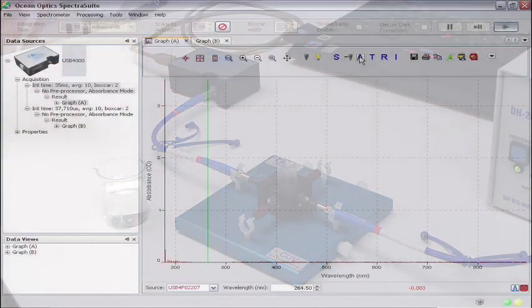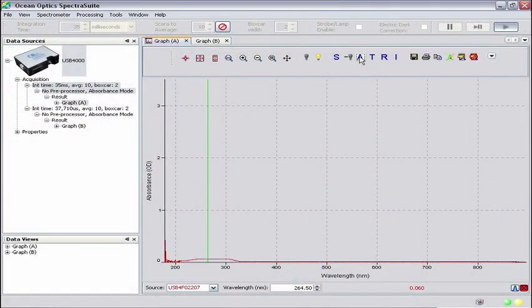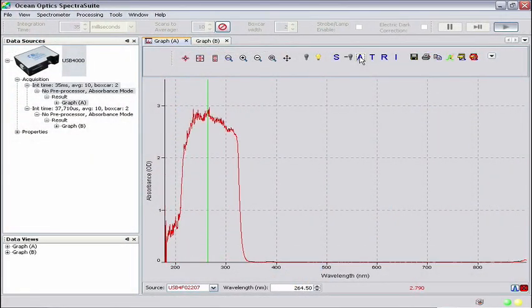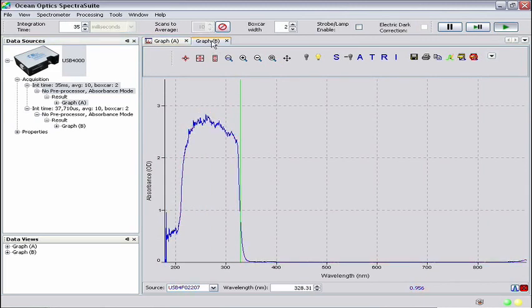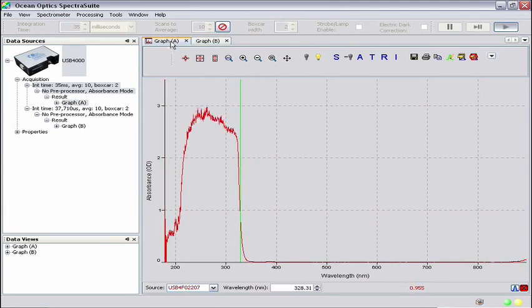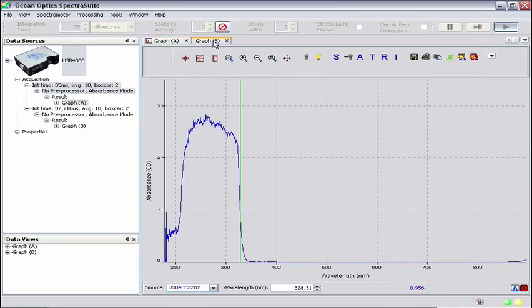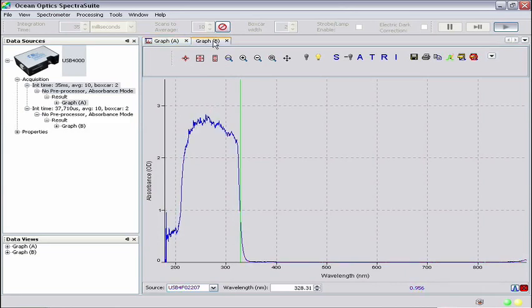Add acetone to the cuvette as you did earlier, and now you will see an absorbance spectrum similar to the one obtained using the wizard. To verify this, toggle between the Graph A and Graph B tabs and see how the spectra compare. These steps should get you started with basic absorbance measurements. In future videos, we'll cover areas such as Beer's Law, sample preparation, and alternatives to cuvette holders for sample collection.